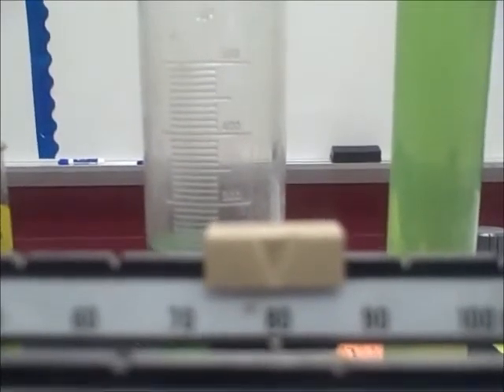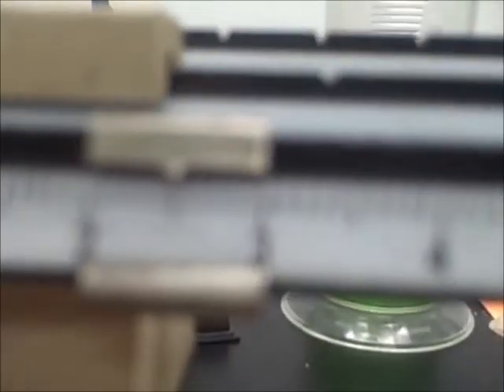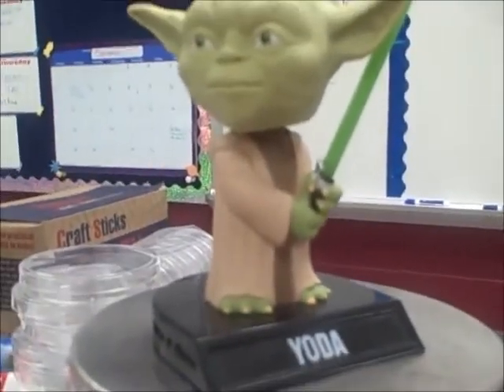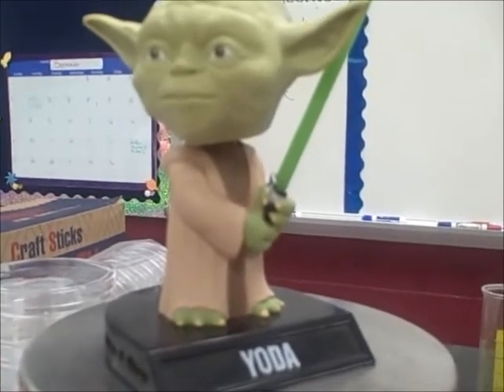Now we are lined up at zero. If we take a look at our riders, we have 80 in the back — I know it's a little blurry, but trust me, 80 — then 2.5. So our Master Yoda here has a mass of 82.5 grams, and that's how you would use a triple beam balance.